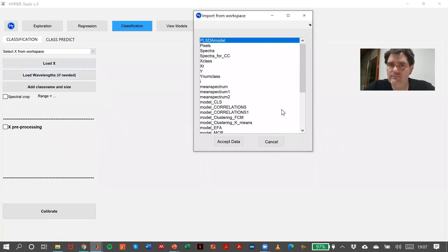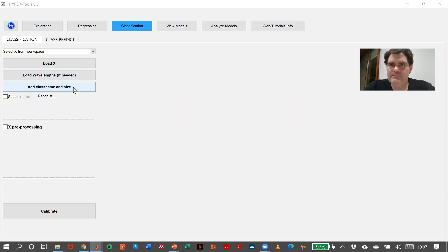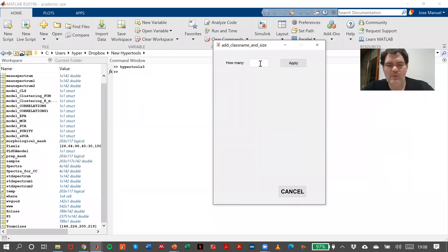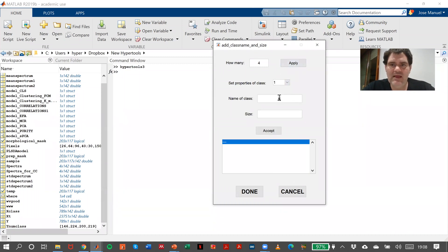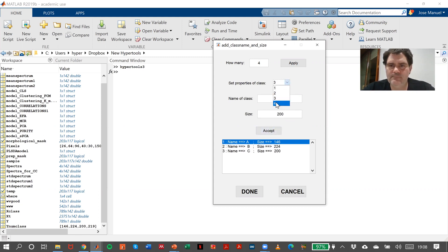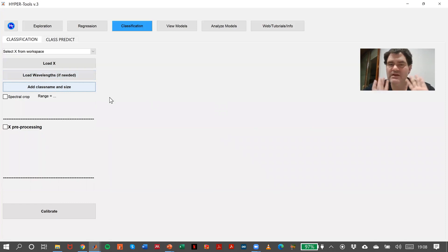Then we have to load the wavelengths. And then we have the class name and size. I will open here — we have MATLAB in display because it's going to be easier. How many? Four, because we have four plastics. The first one, A, with a size of 146. The second one, B, of size 224. The third one, C, of size 200. And the fourth one, D, of size 219. Accept.